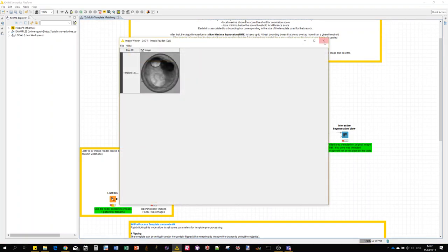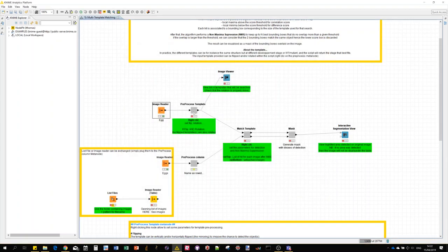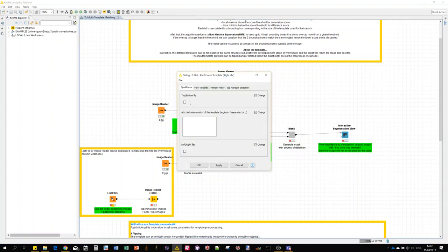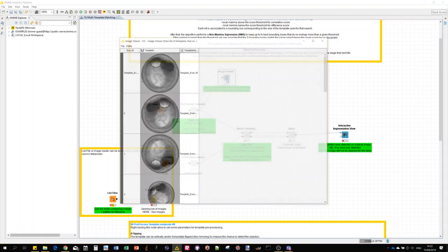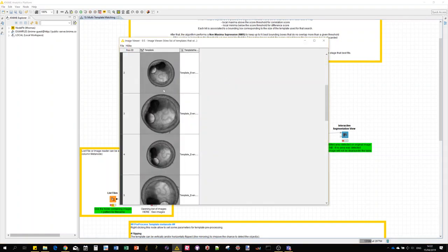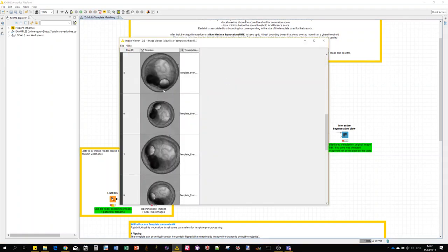Let's say 45, 90, just setting a random set of angles. You can have a look here at the result of the rotation and flipping just to see if you're happy with them. Some of them look smaller but actually it's just that the image is scaled because they're actually bigger.